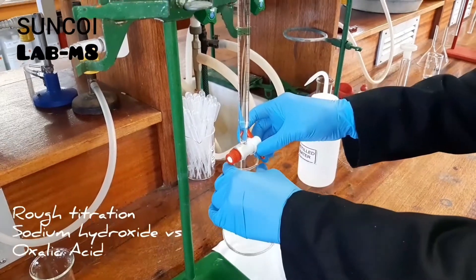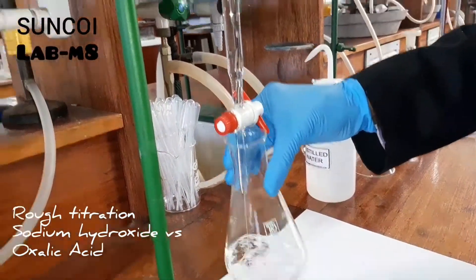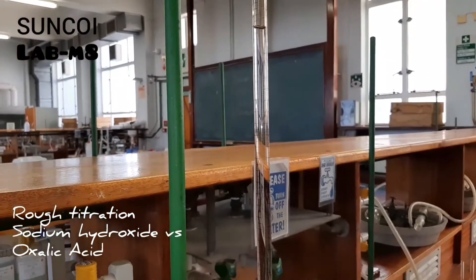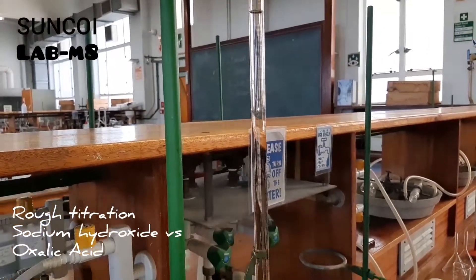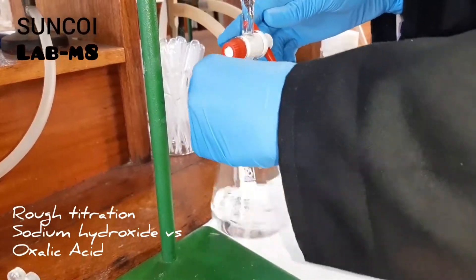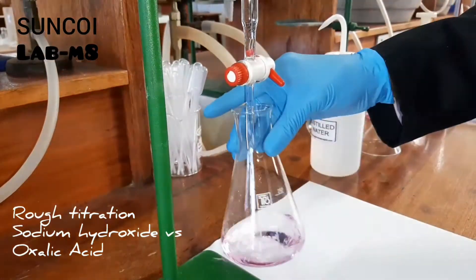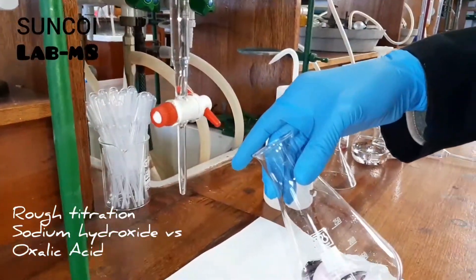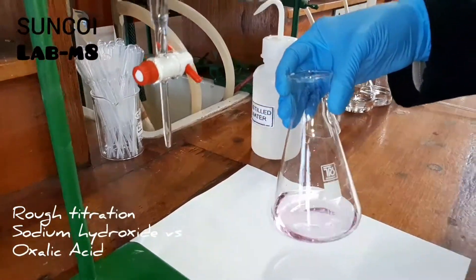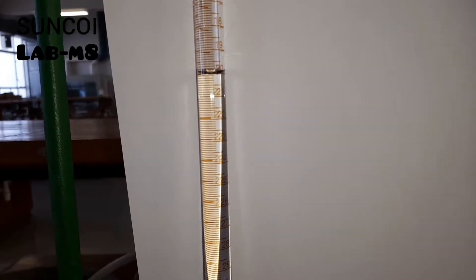Now Nusrat can start with the first rough titration. Remember, you'll do one rough titration and three accurate titrations. The purpose of the rough titration is just to get an idea of how much NaOH it will take to neutralize your oxalic acid. The video was sped up a bit, but clearly you can see we've reached end point — press pause to check what the volume is.